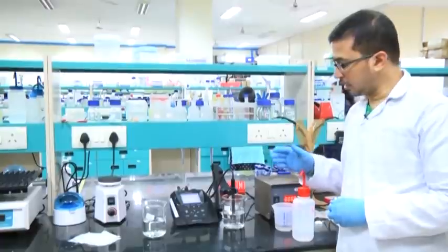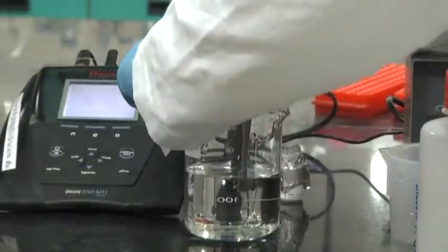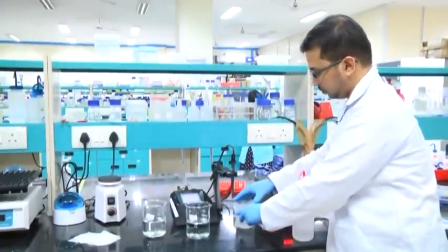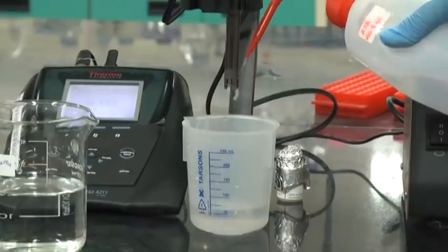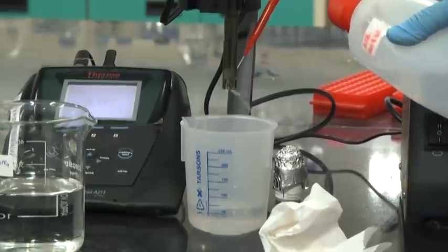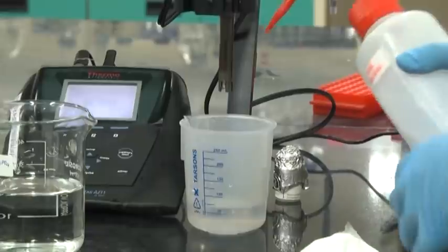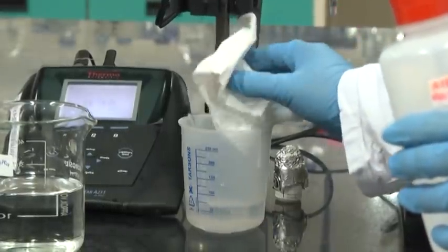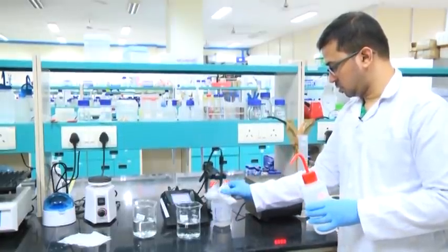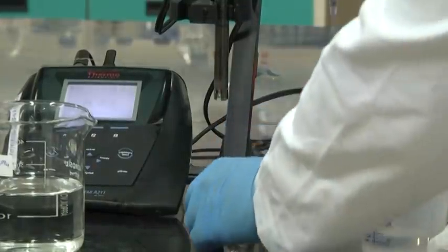Once we have measured the pH of both solutions, we will again wash the bulb, take it carefully from the solution, wash again using double distilled water, and wipe it using a tissue paper. Then immerse it in the solution.